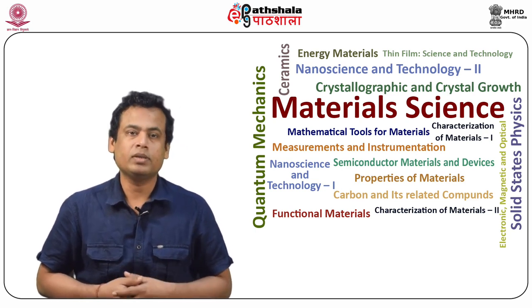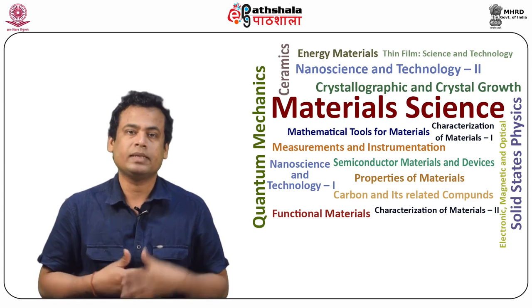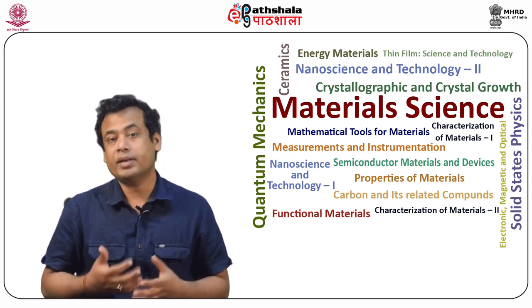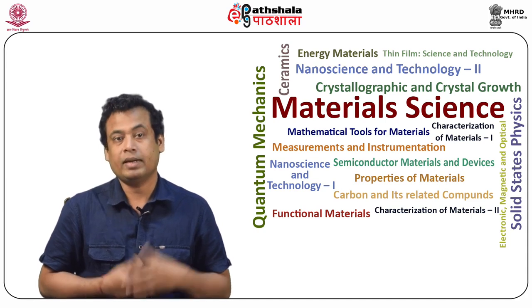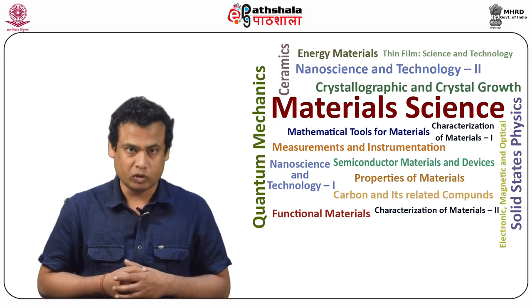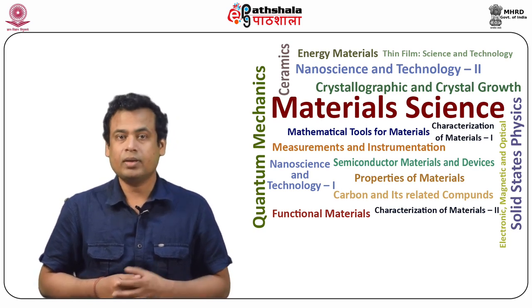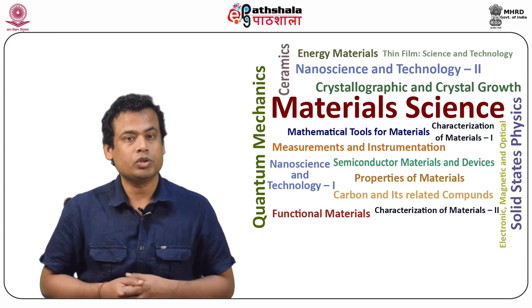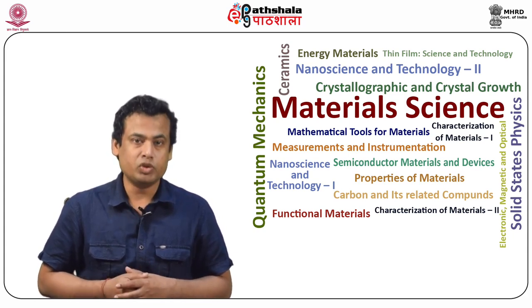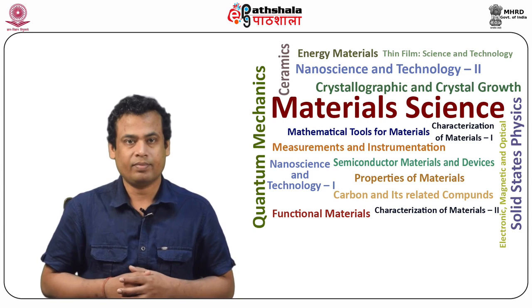First, we learned that electrons from a source interact with atoms in the specimen, yielding a variety of photons and electrons via elastic and inelastic scattering processes. These are the signals that we use to make images and measure to characterize the composition of our specimens.